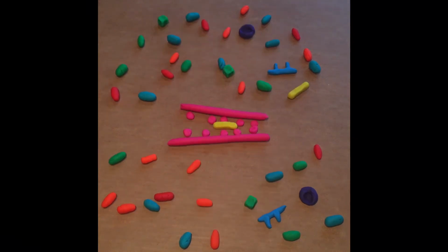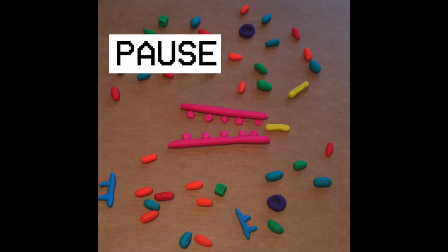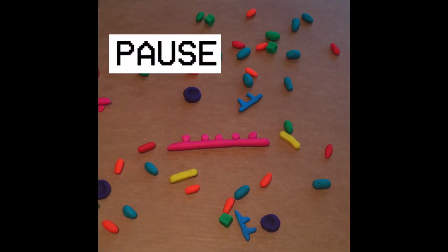At first, we only have a double strand of DNA which we do not know the order of, shown as the pink helix. We must split the DNA in two to get individual strands, the target strand and the template strand, which is done by DNA helicase, represented by the yellow rectangle. The target strand is the sequence that we want to know. By using the complementary strand as a template, we can create an exact copy of our target to analyze.